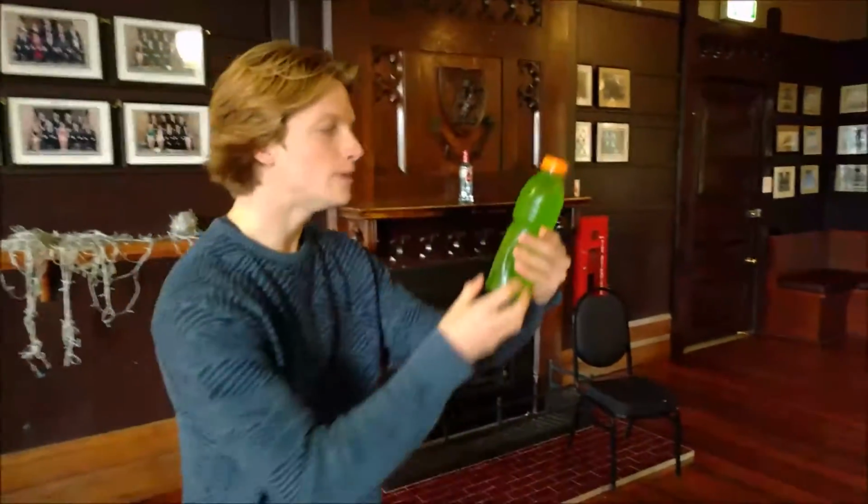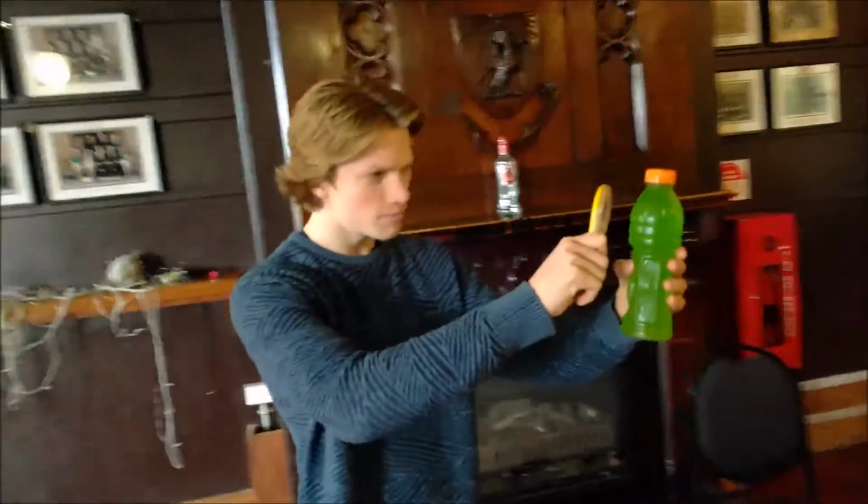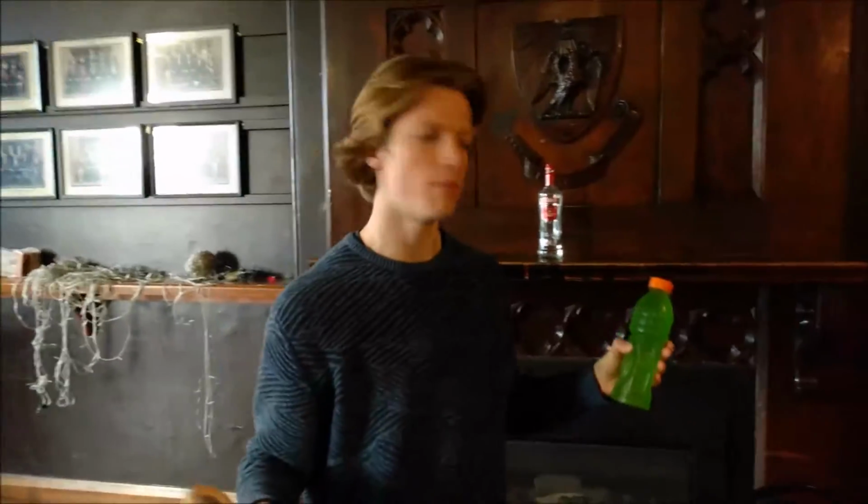Nanoparticles have been a conundrum to the human mind since the Lycurgus cup in Roman antiquity. But how can we measure such particles? Can we squint to see them? Can we use a magnifying glass? What about a light microscope? A light microscope will magnify up to 1,000 times. However, this is still not enough to see the particles on the nanoscale.